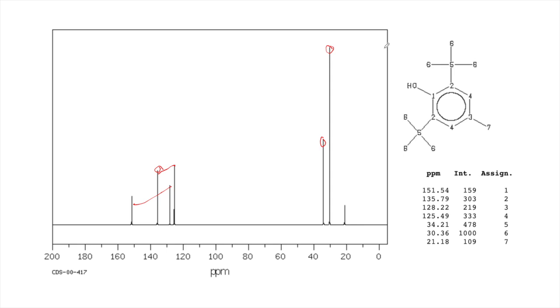But this is what your typical C13 spectrum looks like. Our big thing is counting the peaks to see how many unique carbons we have, and then to box them in that 0 to 50, 50 to 100, as I said before. And also, remember that when you see little peaks around 77, that is usually the solvent that you're going to use. That's CDCl3, which you can safely ignore. It's not going to be the thing you care about.